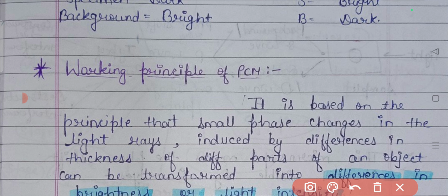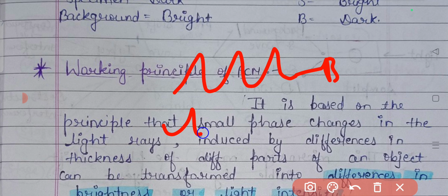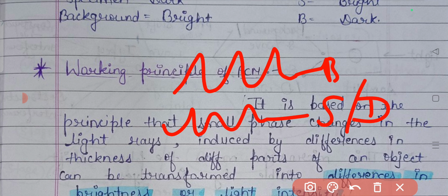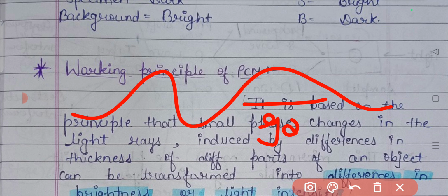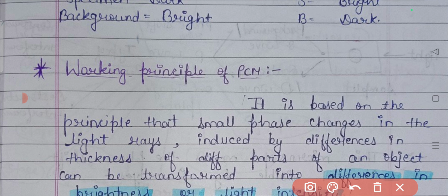Light, again, travels in the form of waves, so this will be your background wave and this will be your scattered wave, also known as the D wave because of the name diffracted wave. What we will observe are these waves, but after that, in the phase contrast microscope, a phase shift ring is present. This phase shift ring shifts the background light by a 90-degree angle so that we will not see so much difference here, and a new type of wave is generated, known as the P wave.